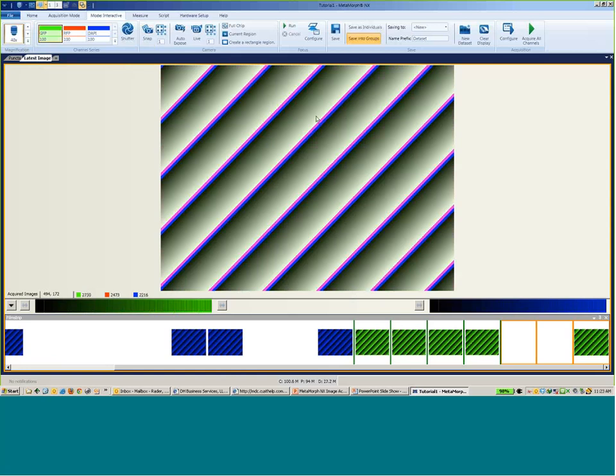Stage series, so this allows you to edit the position specifically. I can also add a new line for that. I can adjust the labels of what they're called. I can actually go to those positions here. Then additionally, if I had, say, a ZDC configured on the system, I can set up an offset for each stage position by the Set Focus button over here on the list. So that's how you would set up a different offset for each stage position, through the configure control in the stage series.